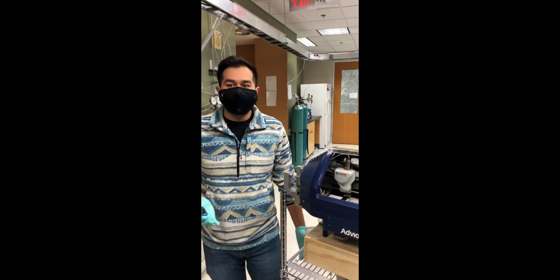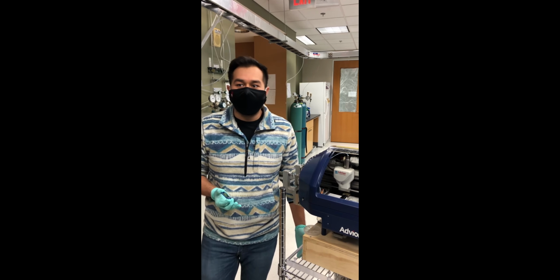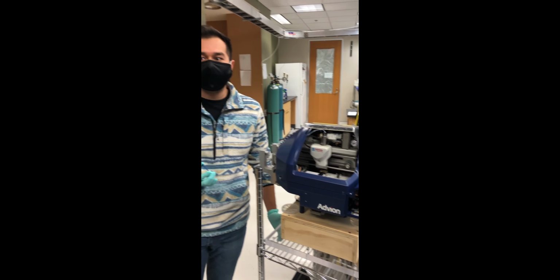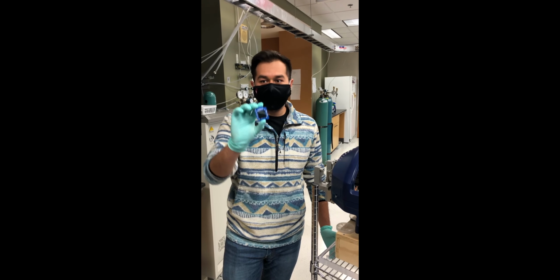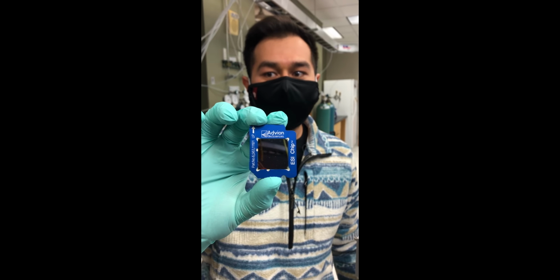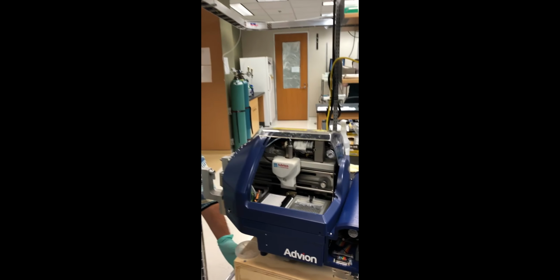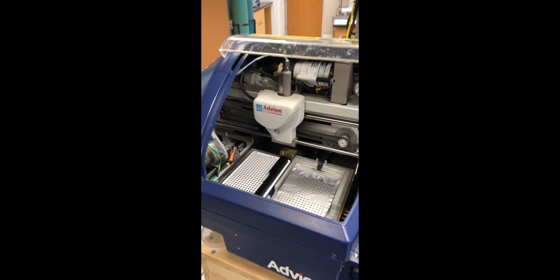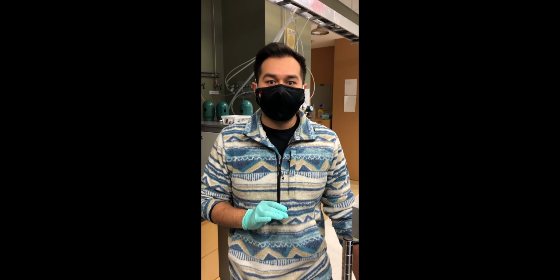Hi, I'm Gerardo. I'm a first-year student, and I work with Gu on the tandem mass spectrometry focus of the phylotox project. We use the TriVersa NanoMate and the Orbitrap Fusion Lumos for automated direct infusion mass spectrometry. The NanoMate acts as an autosampler and an ion source by using this electrospray chip. By using direct infusion instead of chromatography, we're able to run our experiments in a matter of seconds instead of hours. It's worth noting that the Fusion Lumos and the NanoMate were not designed to work together. So the machine shop, the electronic shop, and the Laboratory for Biological Mass Spectrometry facility here at IU all work together to create the setup.